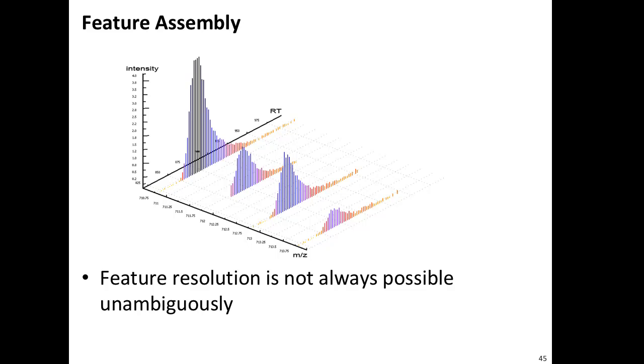But it could also be that this here is a specific labeling that has a mass difference of 2 Dalton. And that's actually where the spectrum comes from. So this was a 2 Dalton shift introduced through a labeling, and then you see stuff like that as well. You can also have oxidation that leads to similar shifts. So it's good to know that, and it's good to be aware that these things can happen.